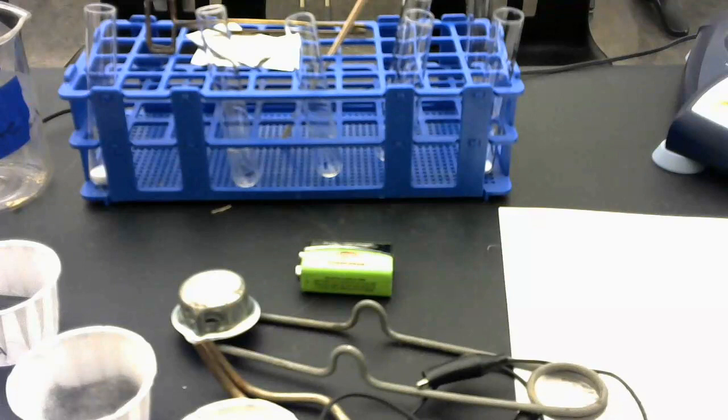Be sure to record your observations, balance the equations, and write the word equation as you go. And then discard all solutions and everything either in the drain or in your waste container. Also, it's very important that everyone leaves their lab station as clean as it was when you got into class, because it's going to make the transition during this time much easier.